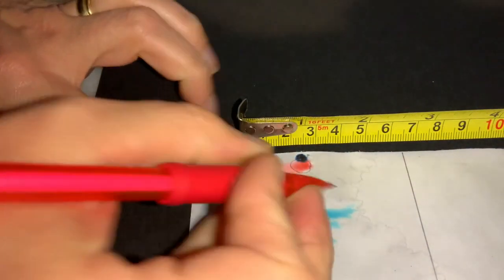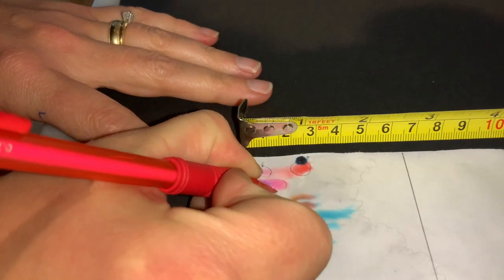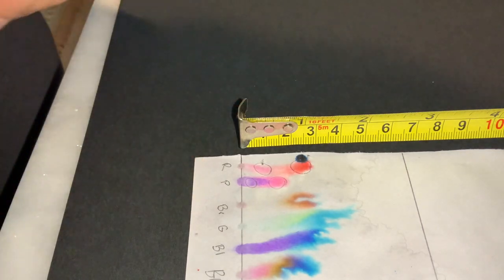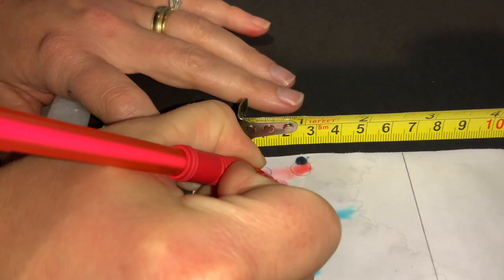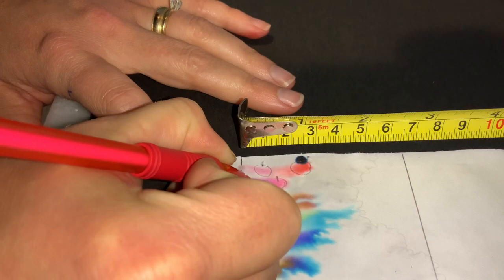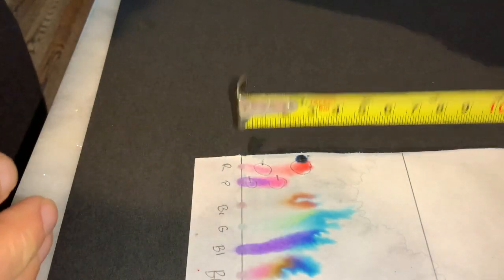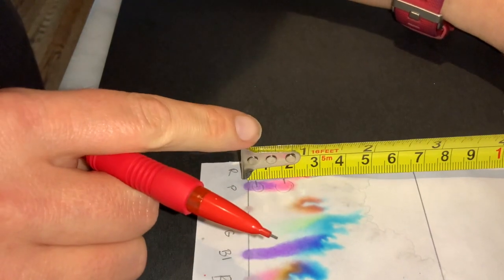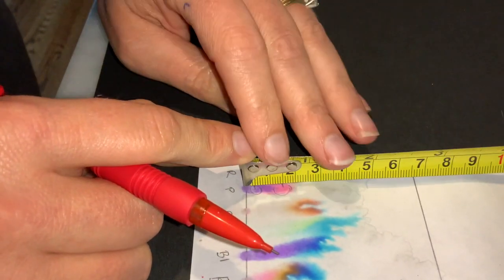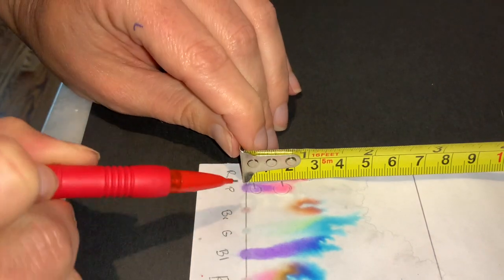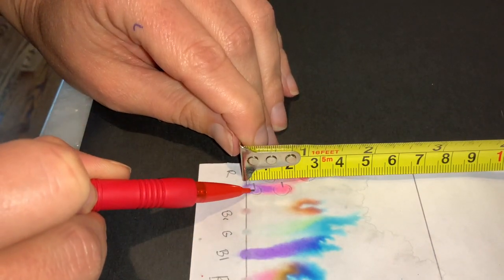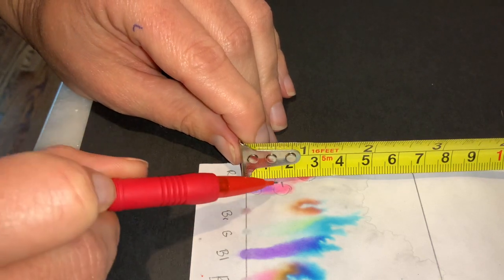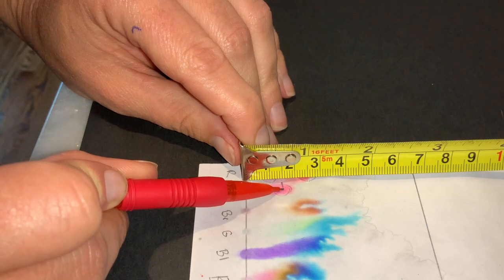Next, we'll look at our purple. So our purple has got, again, two different colors here. So again, you want to measure the distance from your line to this purple spot, and then the distance to this spot.